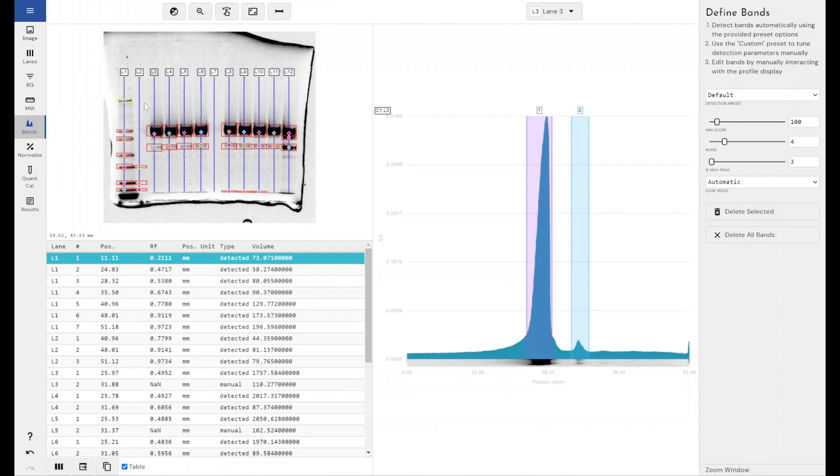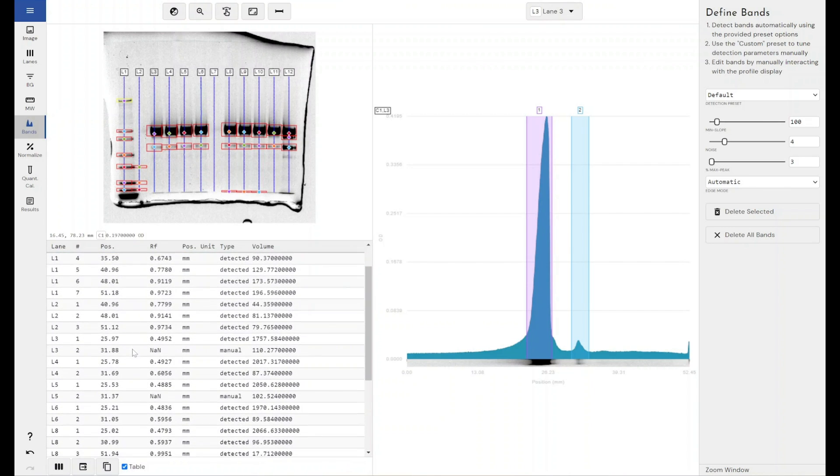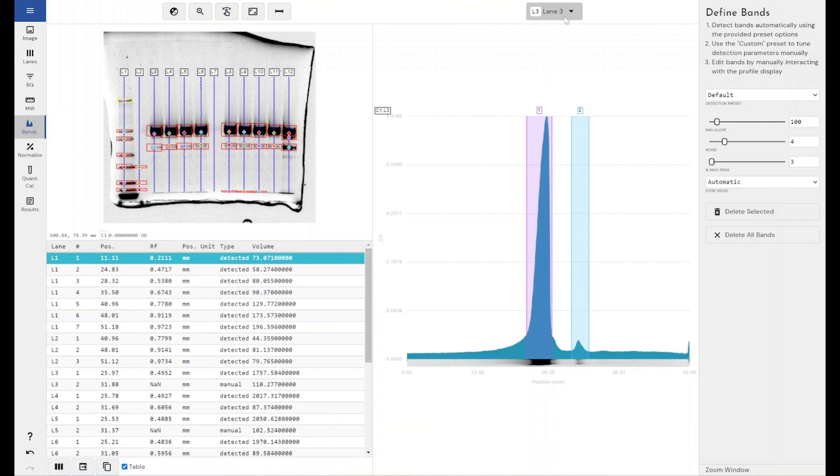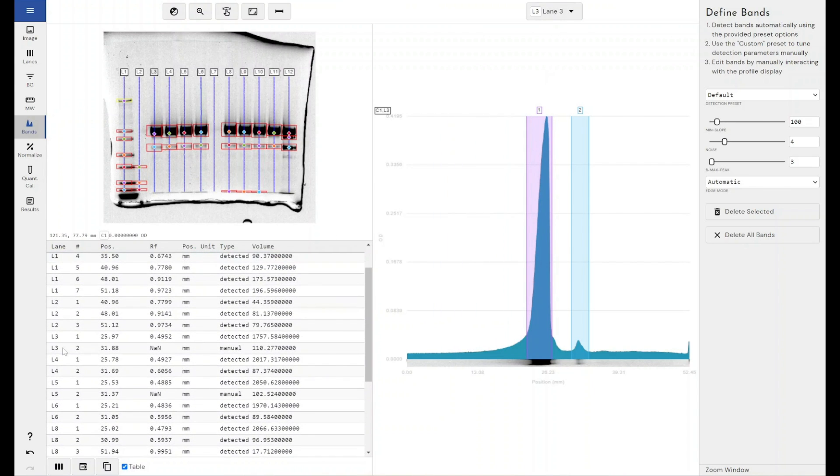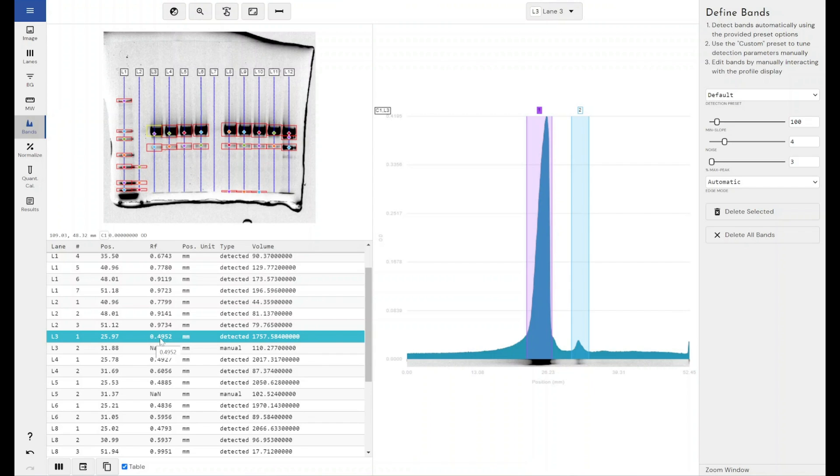If I come through to lane 3, if I turn lane 3 on, so lane 3 band 1, we can see here that this has an RF value of 0.4952. What this means is essentially this band that I'm looking at has traveled about halfway down the lane. So halfway down the theoretical maximum it could have possibly traveled.